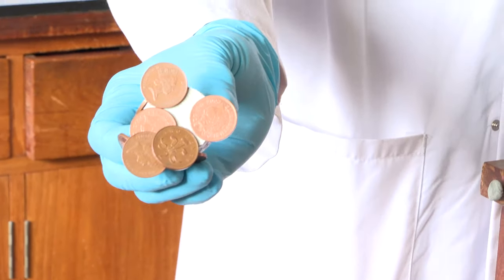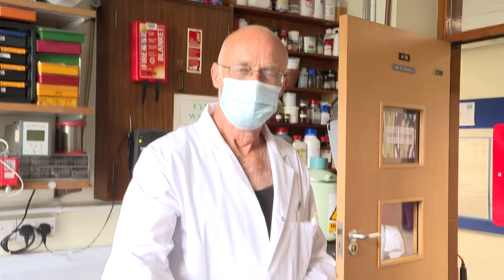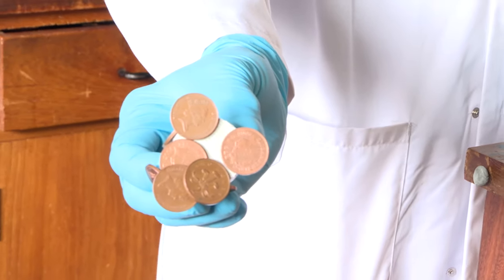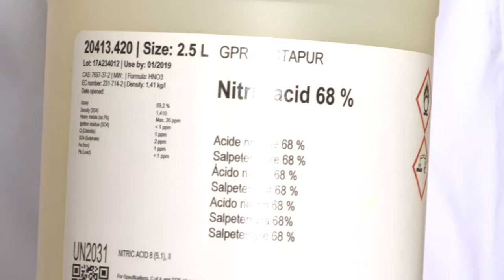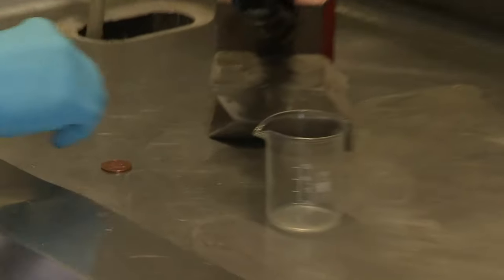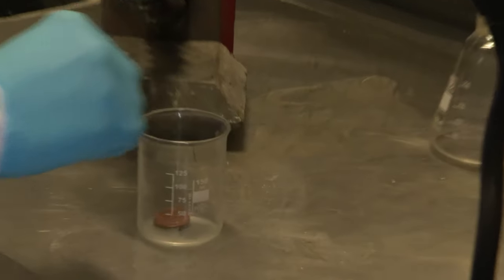But iron is passivated. That is, it reacts a small amount, and then the surface gets a coating, and the reaction stops. Neil tried the experiment before Brady arrived in Nottingham, and it worked perfectly. The copper dissolved, and he was left with an iron coin that looked more or less the same as the copper one. You could see all the writing and everything else.